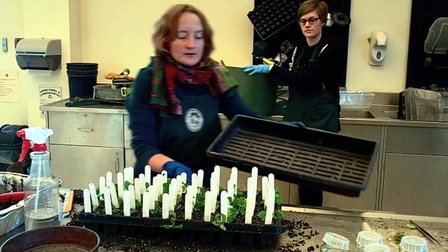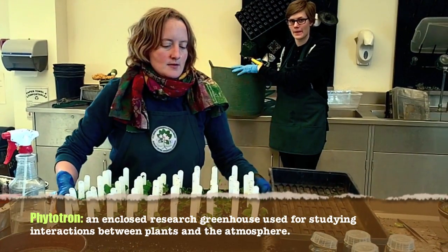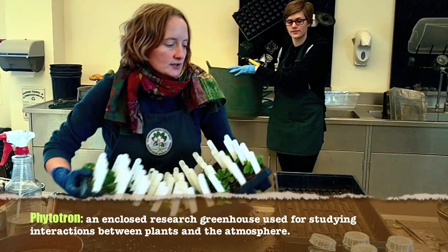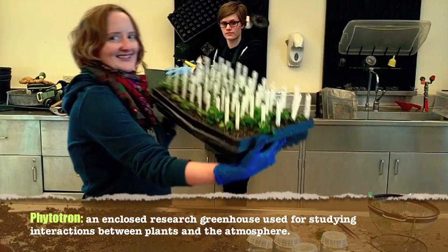So we've transplanted our first tray here. They're going to go out into the phytotron now, just in warm, moist conditions. Here we go.